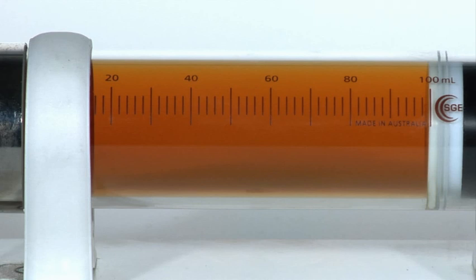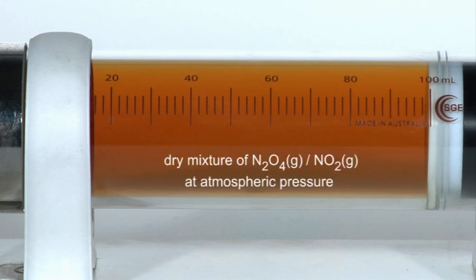The cold trap was evacuated with a vacuum pump leaving solid colorless dinitrogen tetroxide. The compound was then allowed to evaporate at atmospheric pressure into the glass syringe which was sealed with a tap.